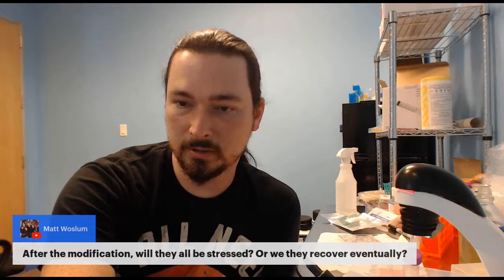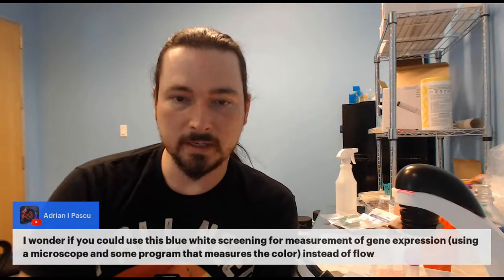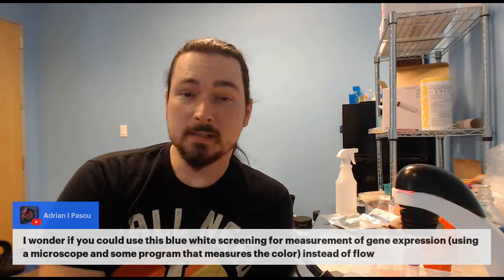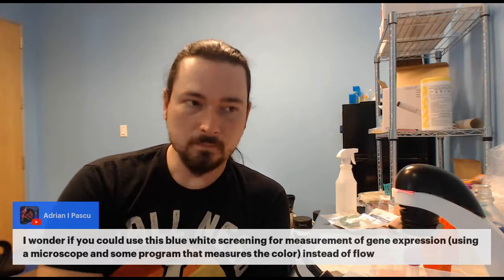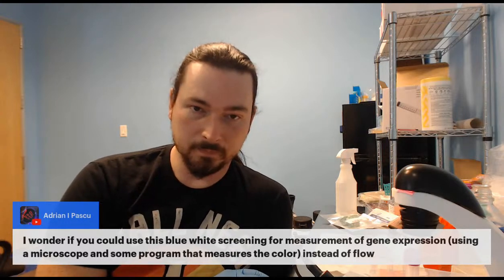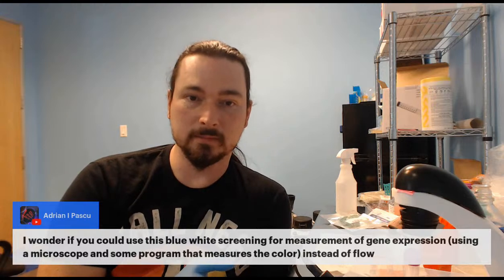I wonder if you could use this blue-white screening for measurement of gene expression, using a microscope or some program to measure it. Possibly. The tricky part is that because it's an enzyme, it's also really time sensitive. The same amount of modified cells will give you a different result an hour later.